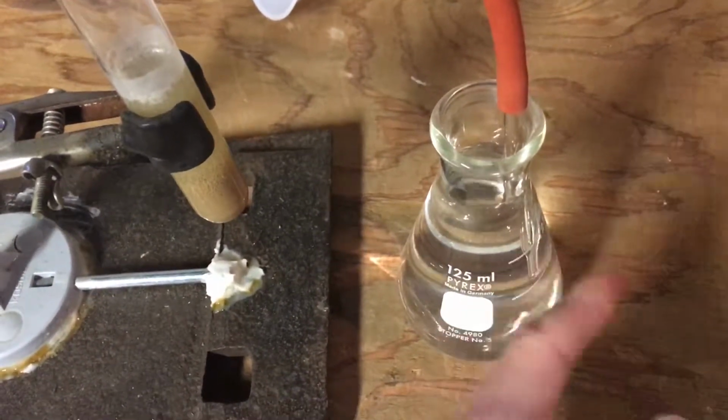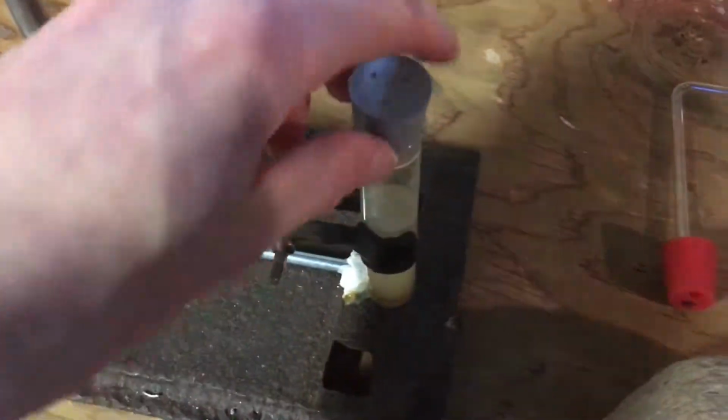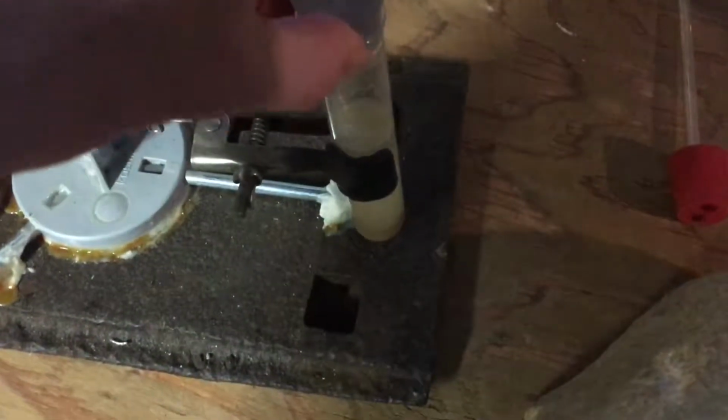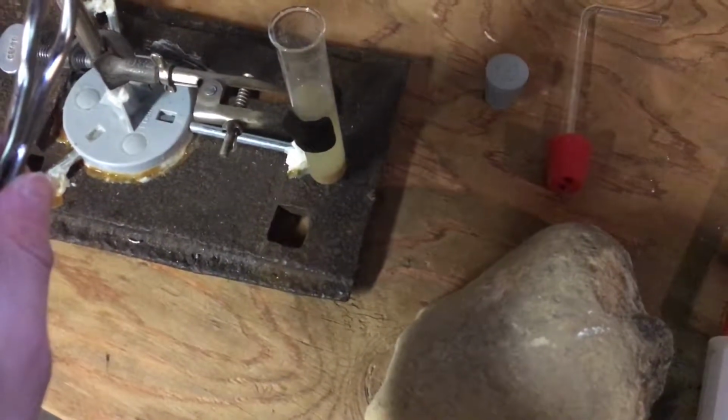You know what? Let's see if we can get something on fire. Alright, so I've got the gas in, and I've disturbed it, so we're gonna light it on fire. Yes. Aha.